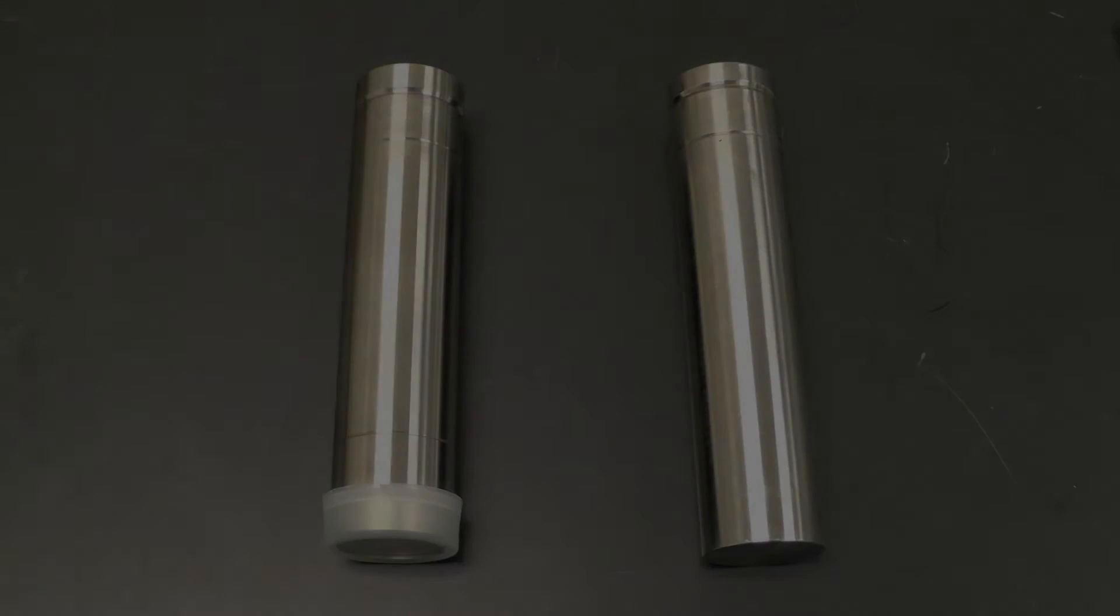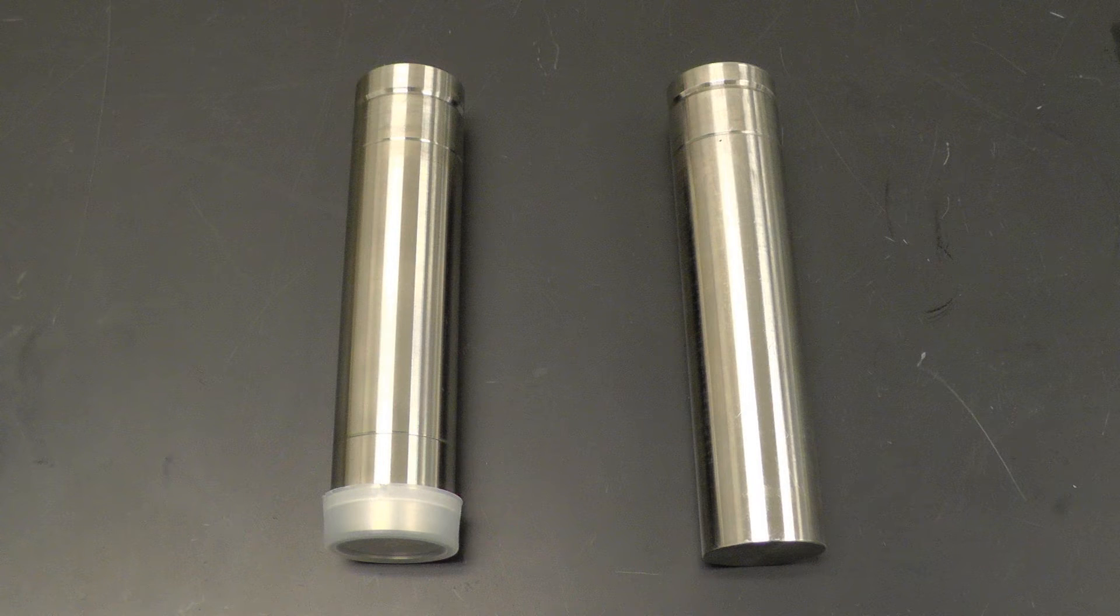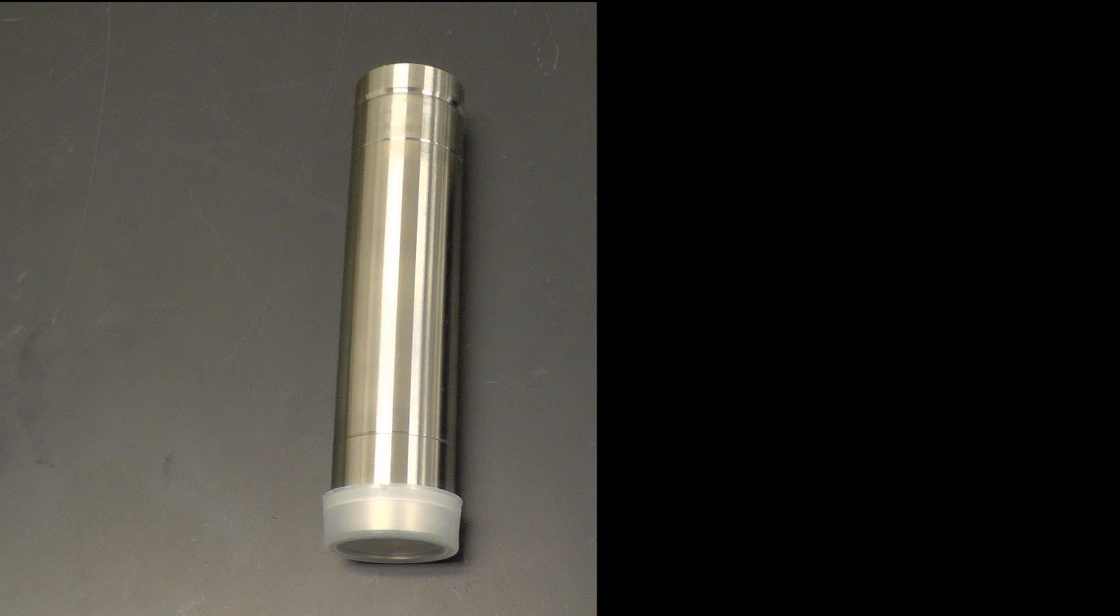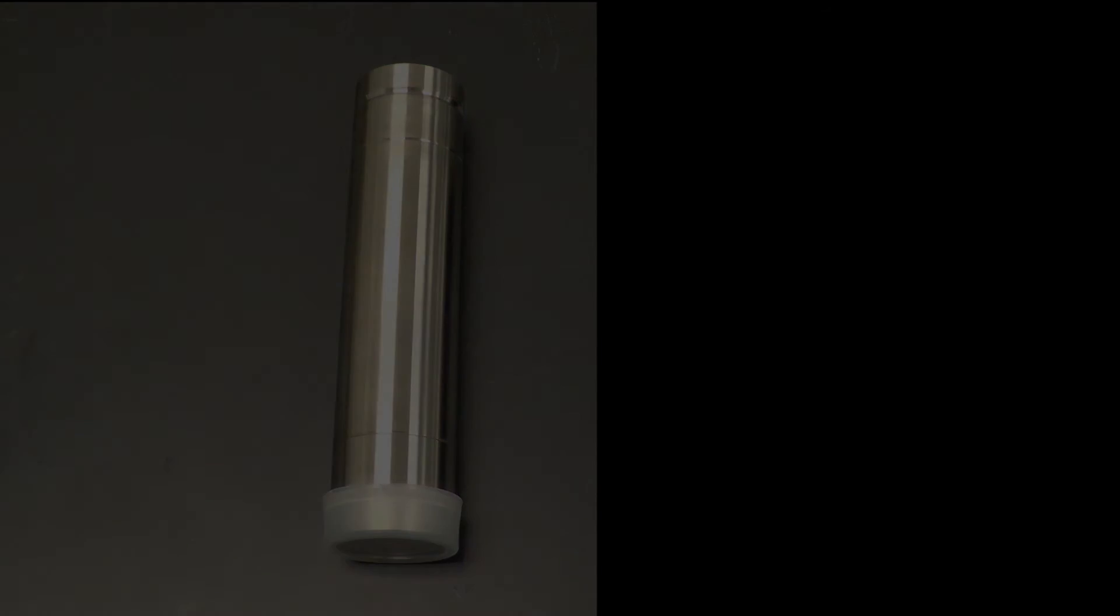There are two options when ordering the UL adapter. The first is the standard UL adapter which comes in 304 stainless steel. This version can be used as either an open tube or a closed tube system.